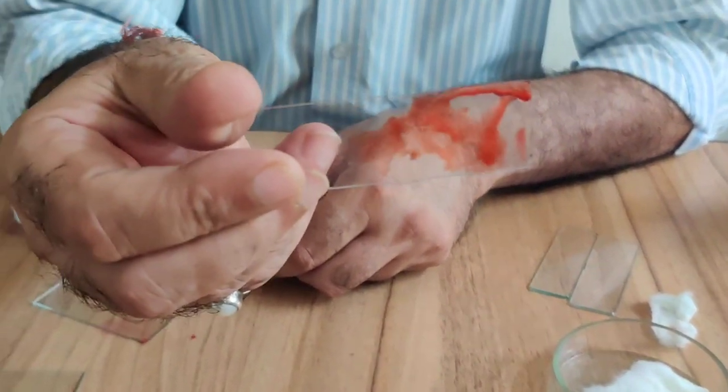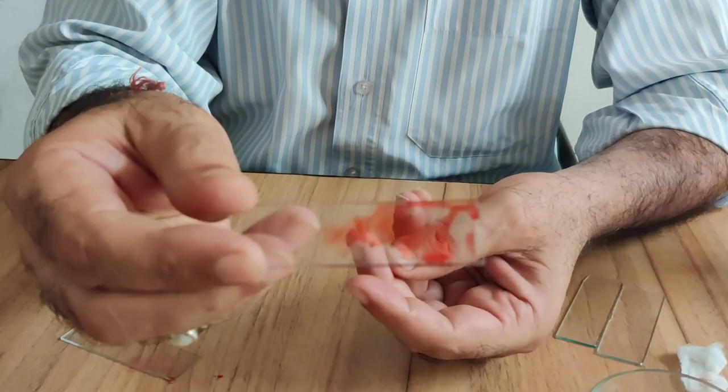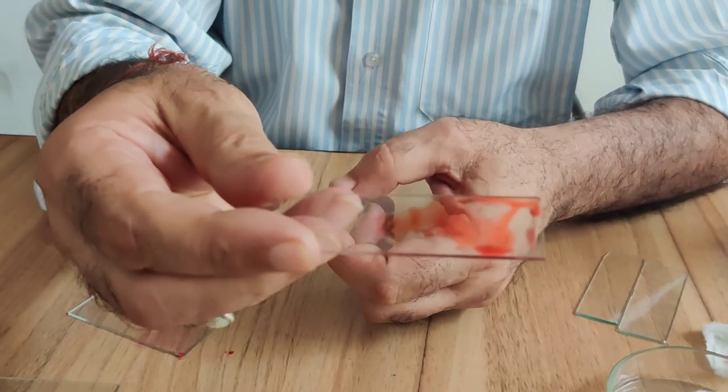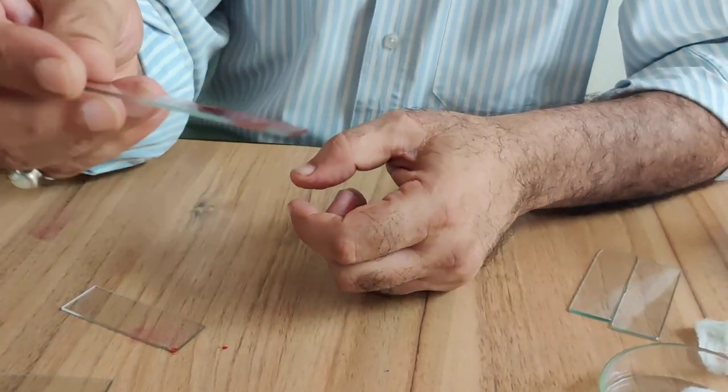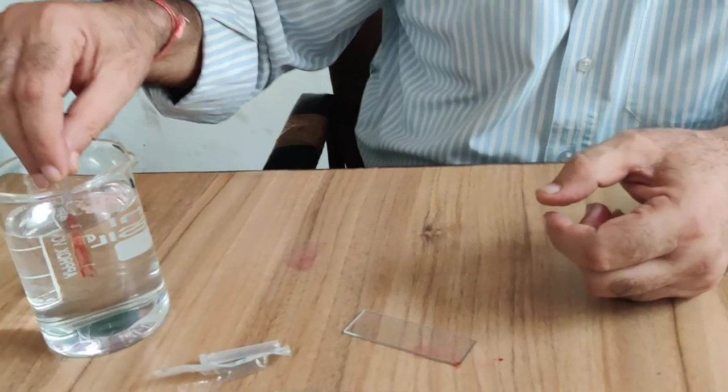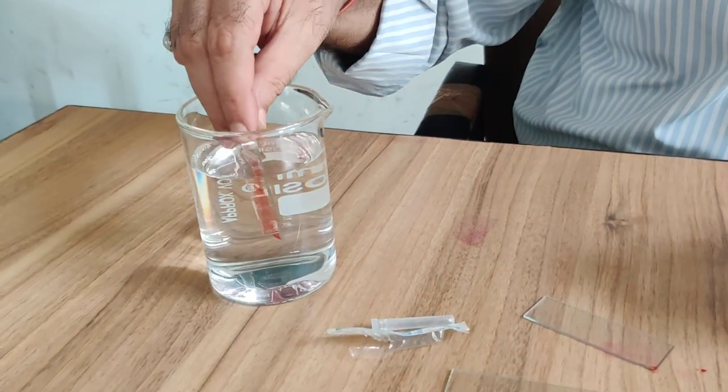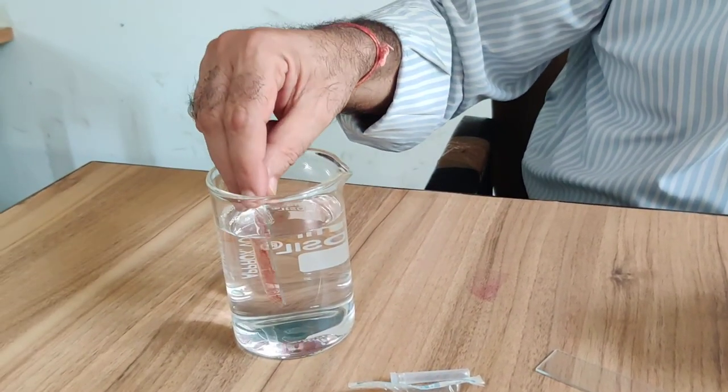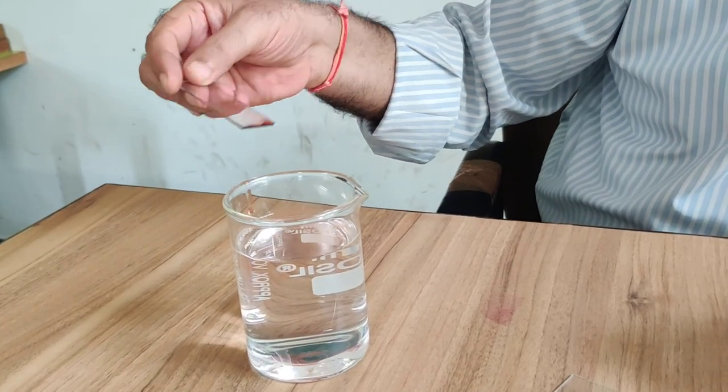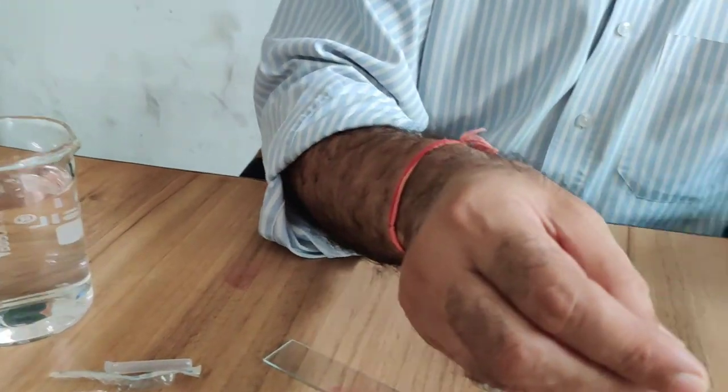Now you can dry it for some time, for two, three minutes you can dry it. After that, you keep it in water to remove extra stain, so extra stain will be removed and blood film will remain there.